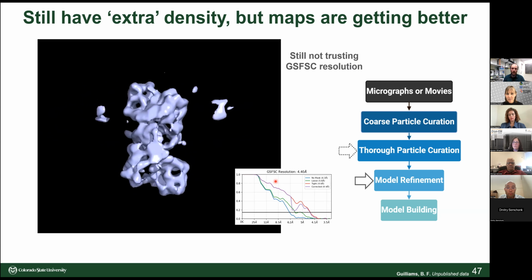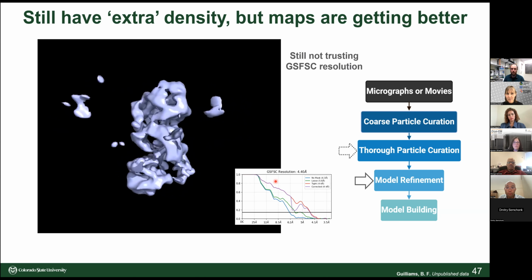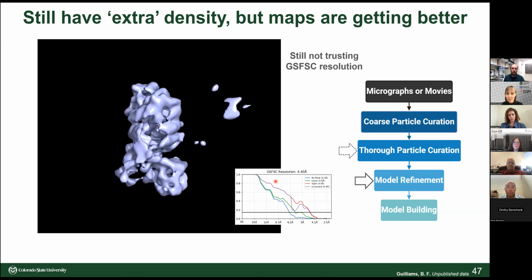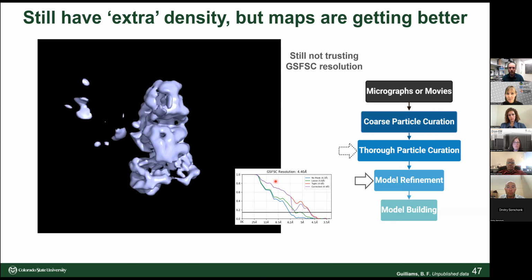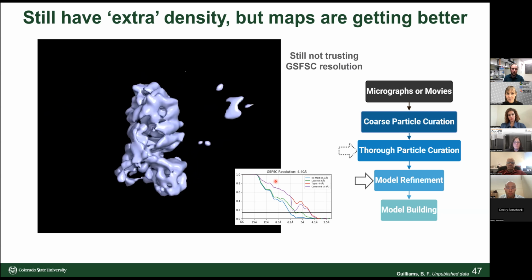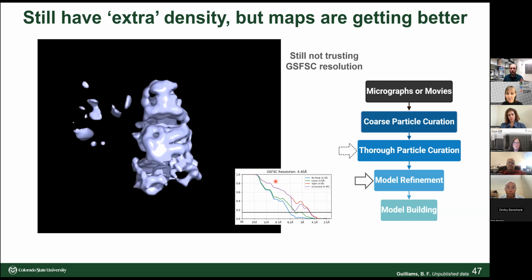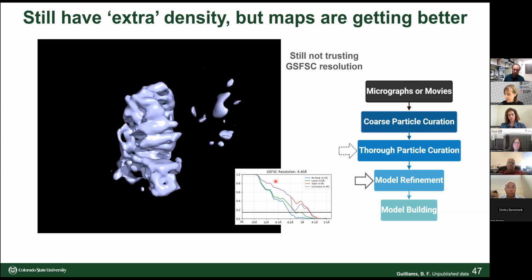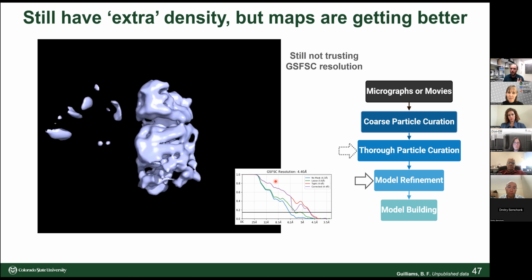But in the TEM, you're not really taking advantage of much Z contrast. In scanning transmission electron microscopy, your contrast is much more related to the atomic number of the element you're using. Whereas in TEM, as I understand it, it's much more mass thickness, much more phase contrast contribution to your image. And I would say resultingly, because it's an amorphous particle, it's actually not that dense.